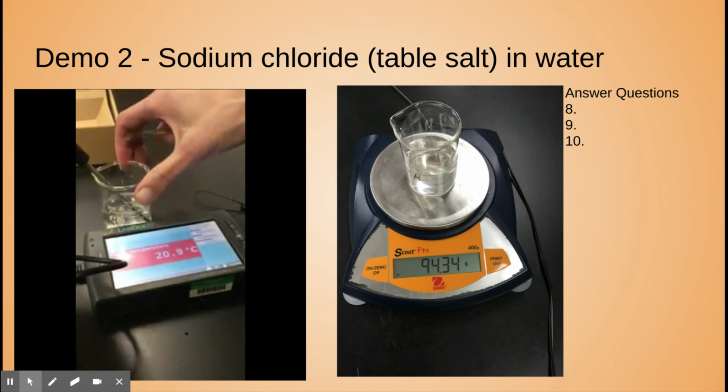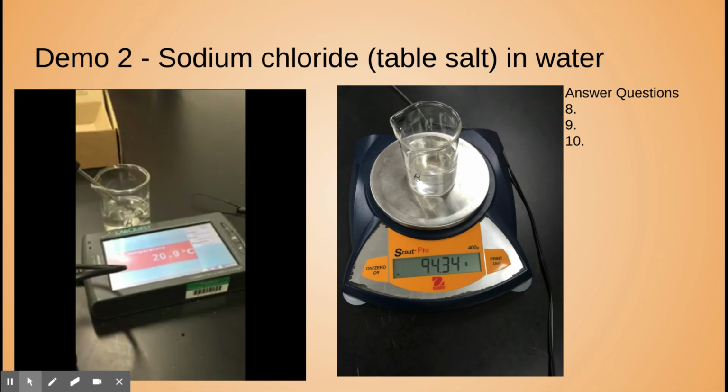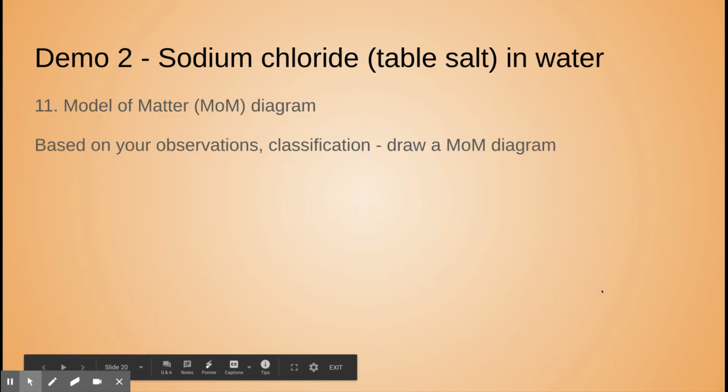All right, so with this you can record the ending mass, the ending temperature, and then take observations, and then start the video up again when you're ready to go.